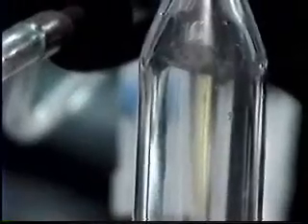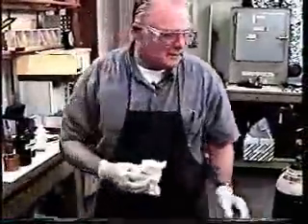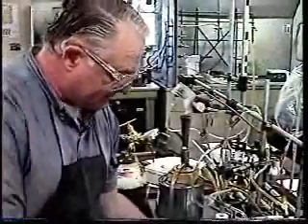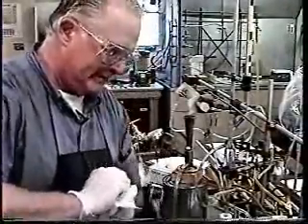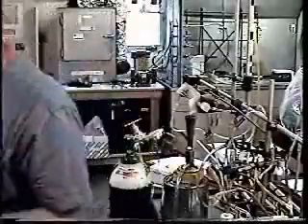Let it drain for a few seconds. Let it drain a little bit there, and get all the carbosorb drained out. Just wipe off the top so we don't get any of this caustic material into our scintillation counter.